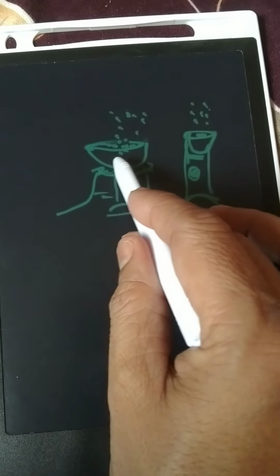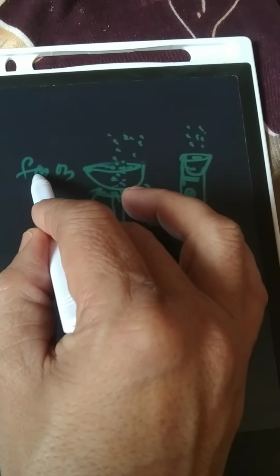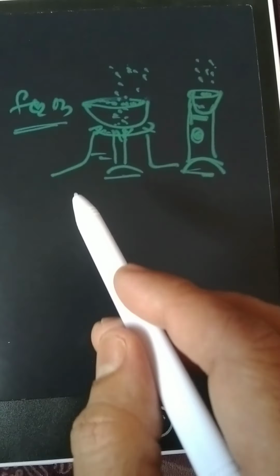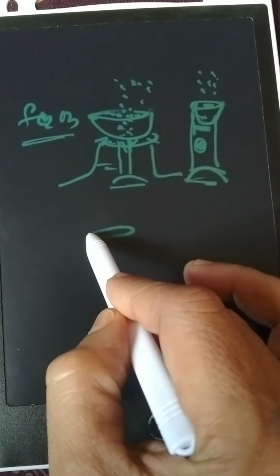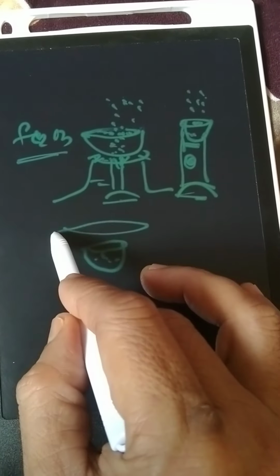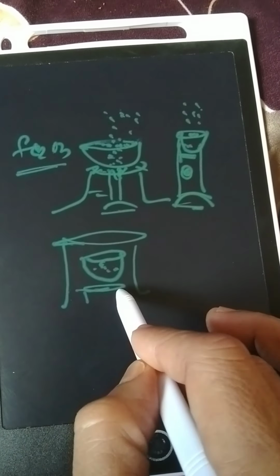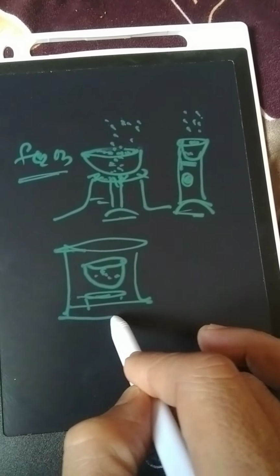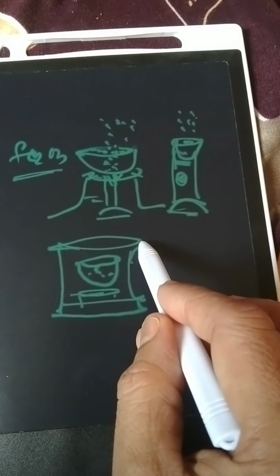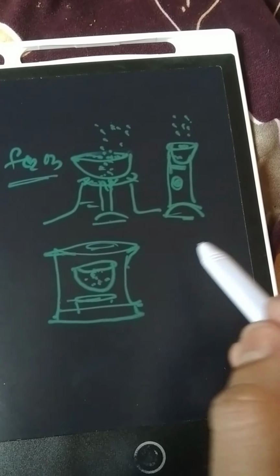the crucible. Residue of Fe2O3. Fe(OH)3 is converted into Fe2O3 by removal of water molecules. Carbon dioxide is also removed, and then the crucible with residue is cooled in a desiccator. A desiccator is used to hold the crucibles, and it is a glass jar with an airtight arrangement, so moisture can be prevented from the residues.